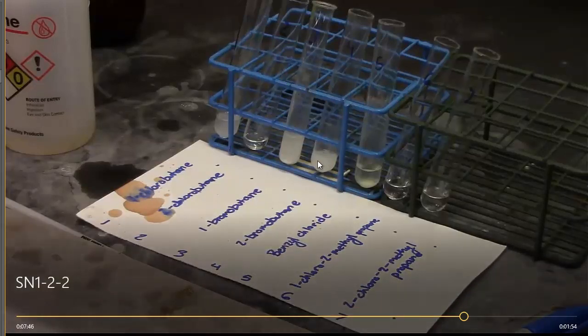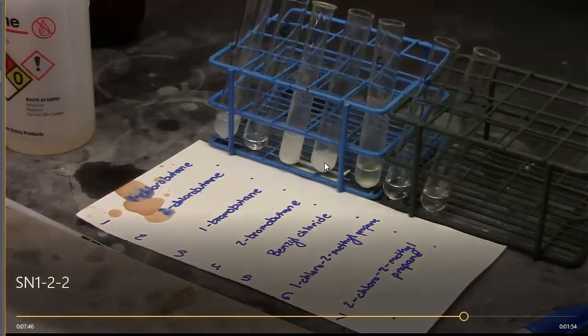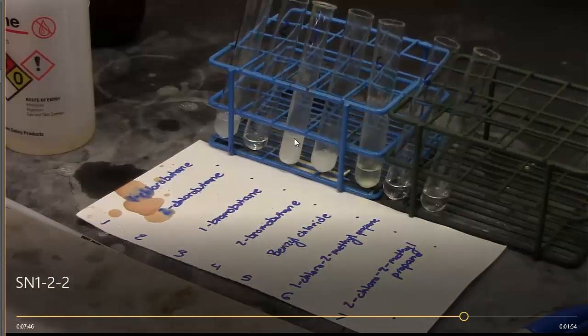So our 2-bromobutane was definitely our third place reagent, so that reacted the third fastest out of our set of 7. Looking at what we saw, we'll say that went at about 15 minutes for an amount of precipitate equivalent to what our 1-bromobutane and benzyl chloride had.